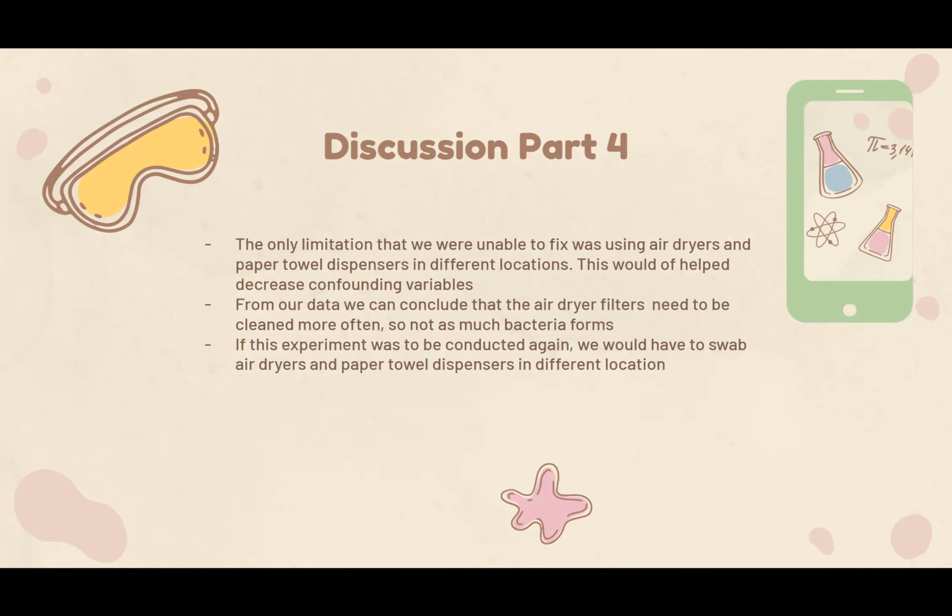Okay, for our data, we can conclude that the air dryer filters need to be cleaned more often, so not as much bacteria forms. And if this experiment was conducted again, like I said, we'll do it in different locations because the Haley air dryer is not as used as the paper towel dispenser in Barnes. Yeah.